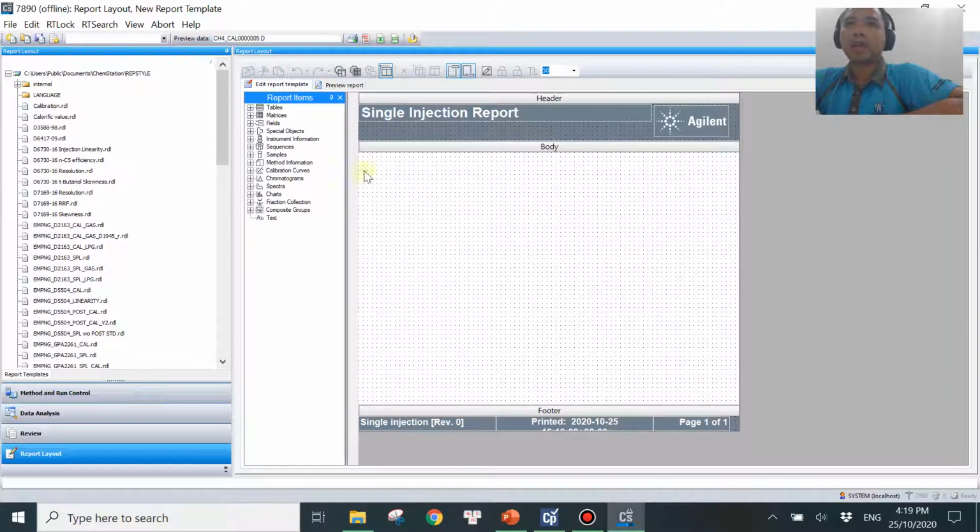Okay, so you can bring whatever fields that you like to have, like sample name, data file, whatever over here. But I'm not going to do that in this video, just to make sure we don't go over time with this one. So I'll just focus more on calculation.